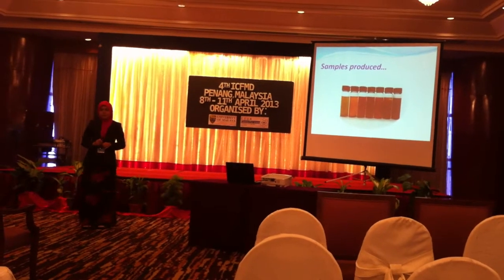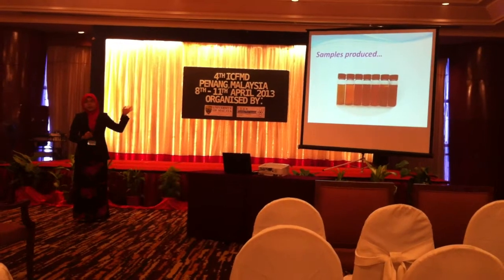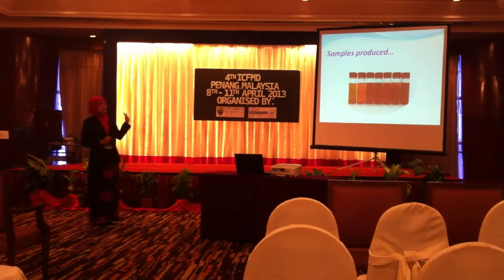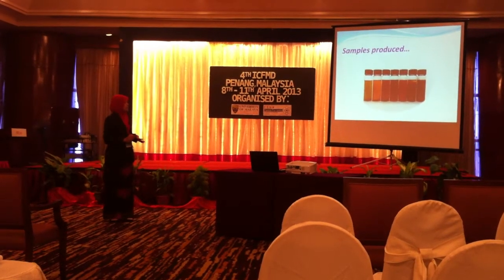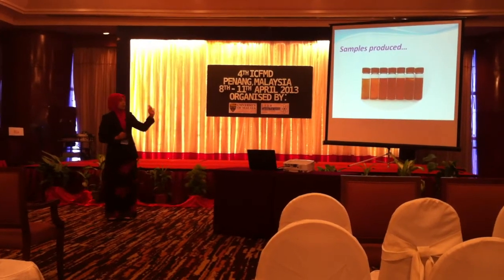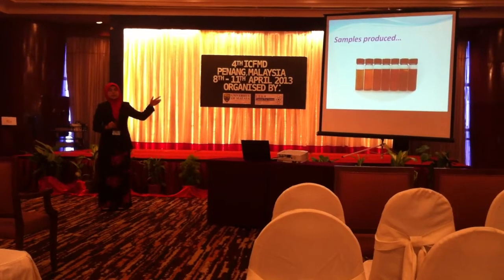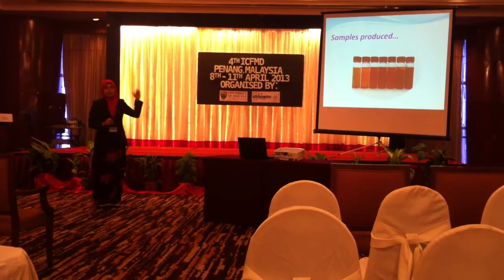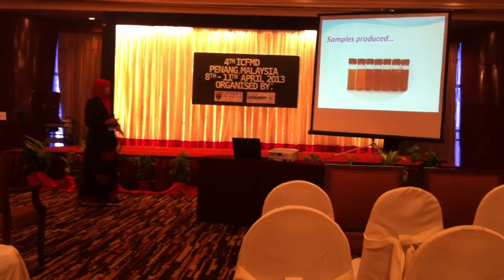Size of my samples, which is 7 samples from the left to the right. With the naked eye, we can see that the samples show different color change with the different reaction time. So from the yellowish to the brownish, it becomes darker. So it approaches the red end of the spectrum when the reaction time increases. That means it increases in particle size.